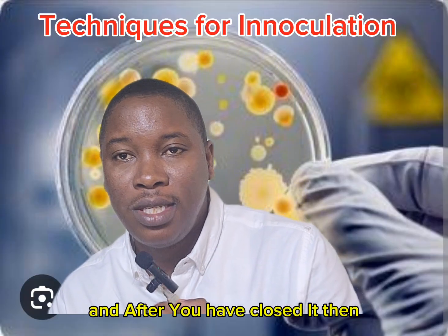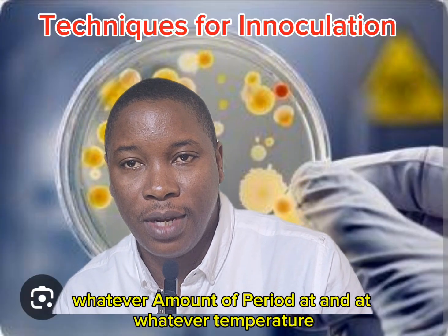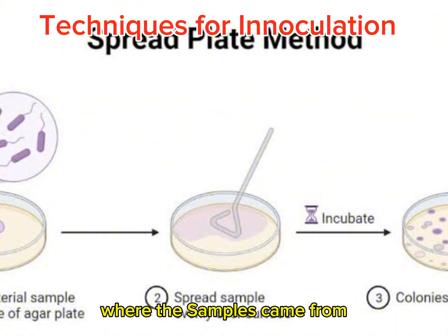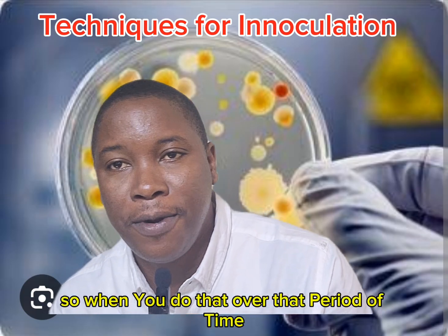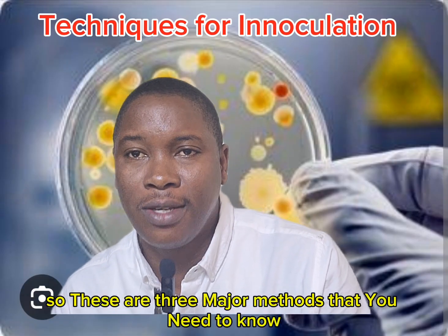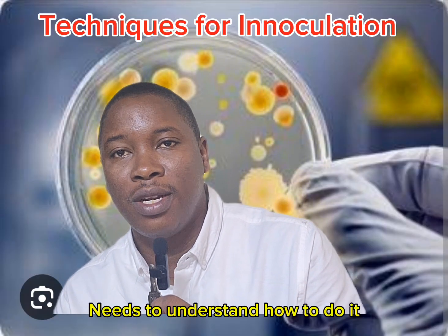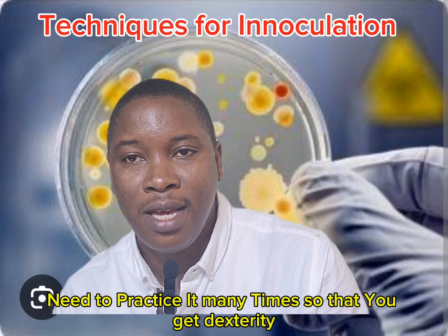After you have closed it, you incubate for whatever period and at whatever temperature you are incubating at, 35, 37, depending on where the samples came from and what you're trying to grow. Over that period of time, it grows, and then you have your isolates. So these are three major methods that you need to know. Every microbiology student needs to understand how to do them and practice many times so that you get dexterity at doing it.